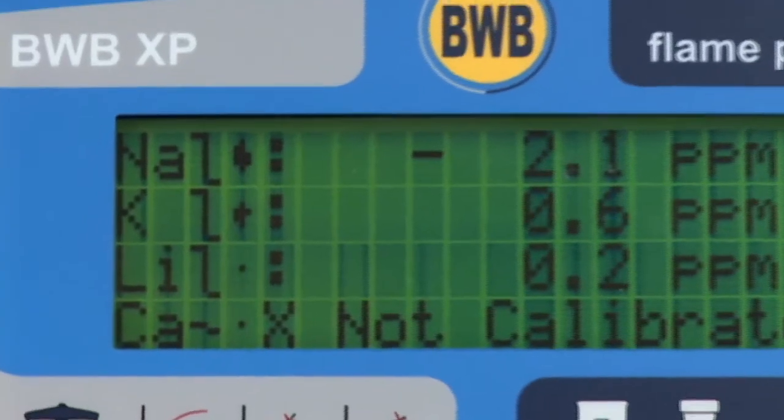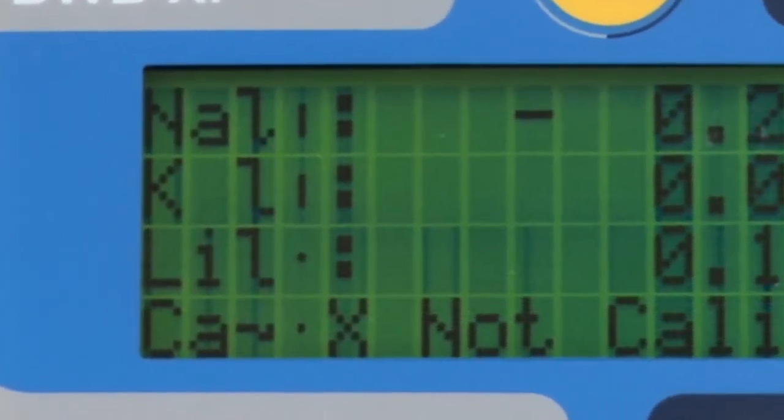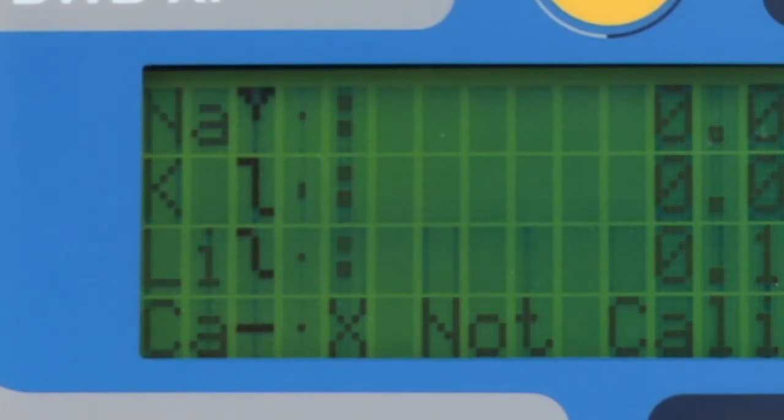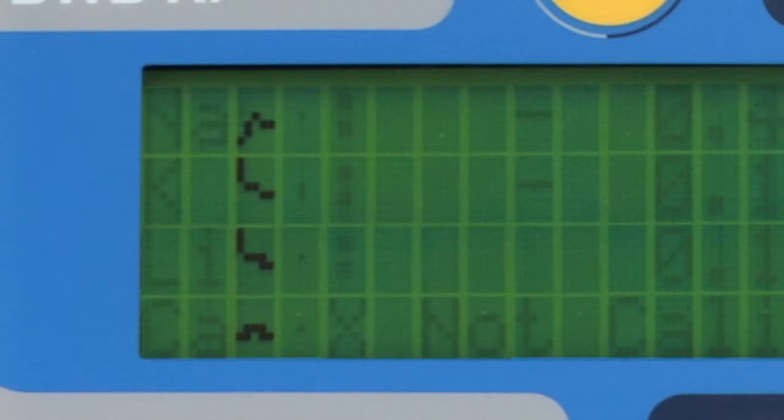There are two icons following the mnemonic representing the ION on the LCD display. The first display is a representation of the graph of the concentration of the ION.